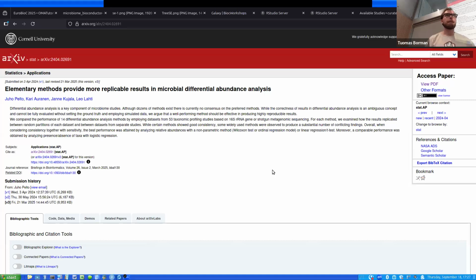So you're suggesting just one method, or to try different ones and see if there are some small tools, some systems that are coming up, because I read a lot of articles. Yeah. And there are two strategies. One is to choose, for example, MetaPhlAn, because it is developed for people on MetaPhlAn. Yeah.